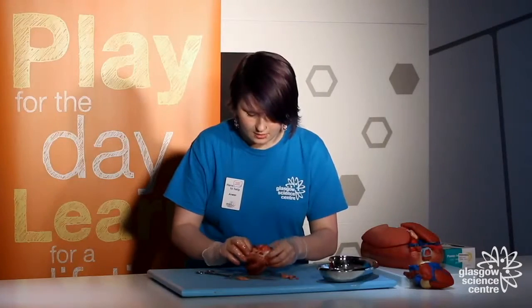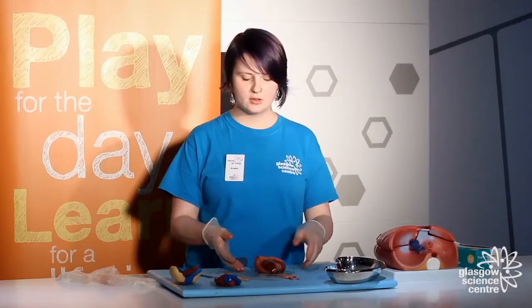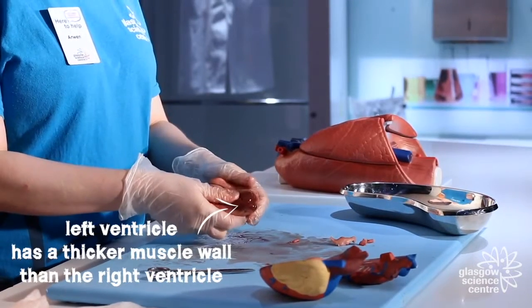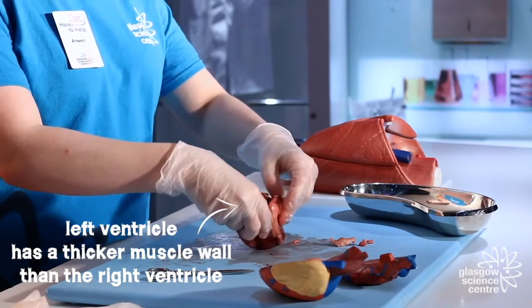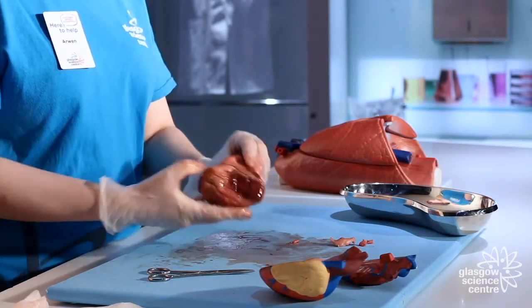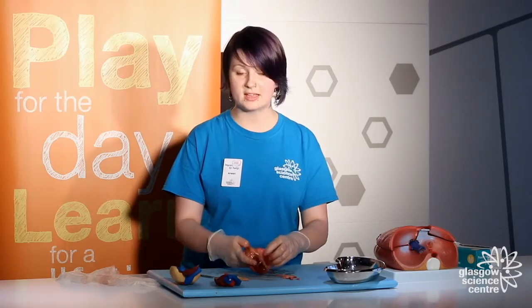Now I've done that, the next thing is to figure out which side of the heart is which. To determine that, you basically just squeeze it. You can squeeze it on the outside and feel for a thicker muscle, or you can put your fingers right into the top and do it there. This side is much thicker and this side is thinner — that's how I've worked out the left and right side.